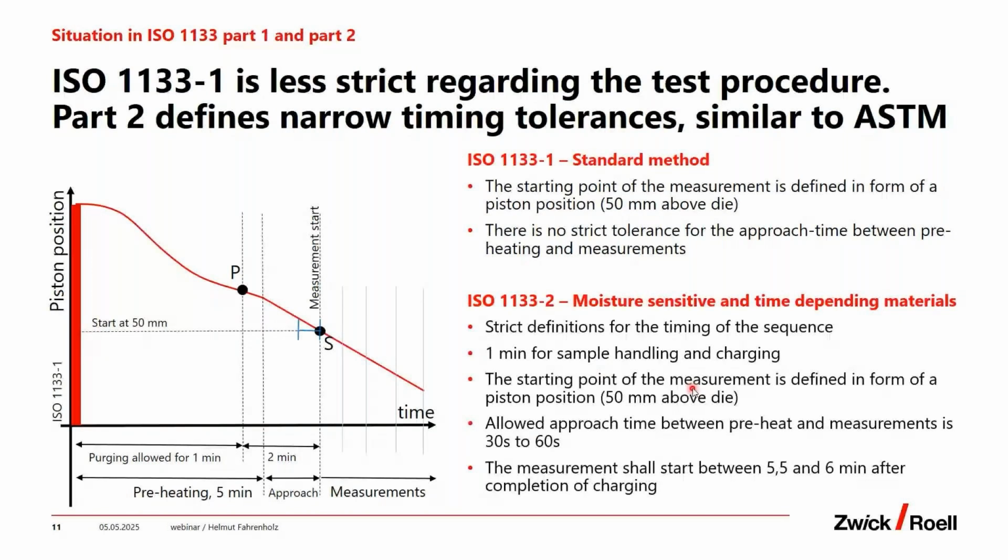Talking about ASTM, if you apply ASTM, it is in many aspects very similar to ISO 1133 part 2, because also ASTM has a quite narrow starting point in terms of position in the barrel and in terms of timing. So ASTM is always very, very narrow.